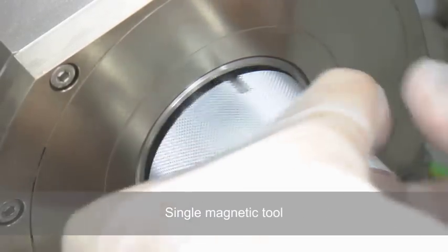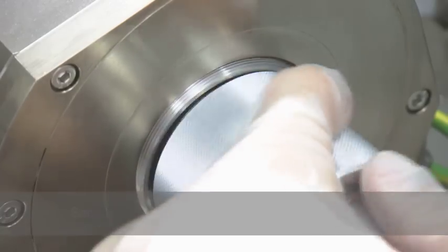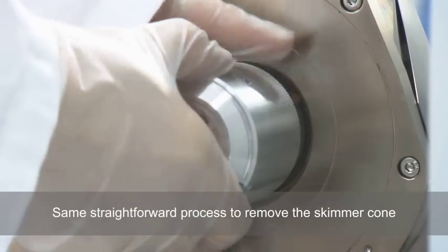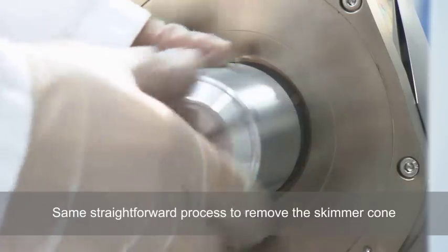A single magnetic tool allows rapid removal of both sample and skimmer cones. Simply rotate to release the mounting ring — the sample cone and ring are removed in a single action. The same straightforward process is repeated using the other end of the magnetic tool to remove the skimmer cone.